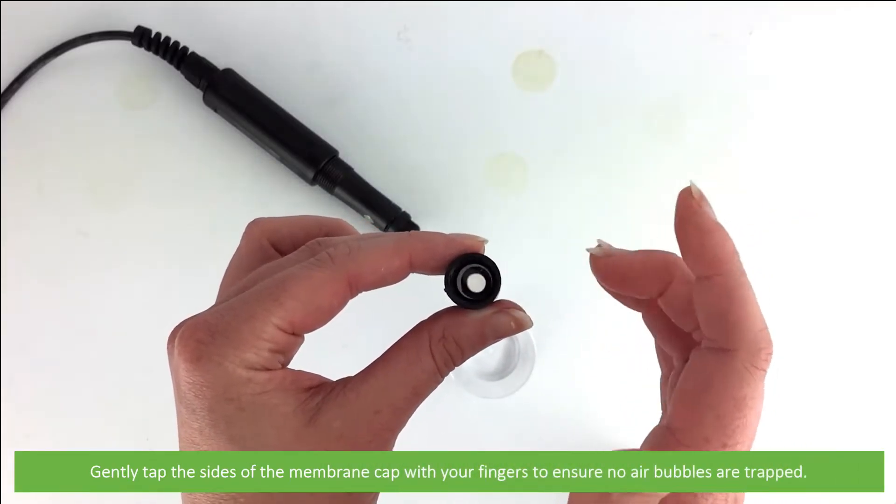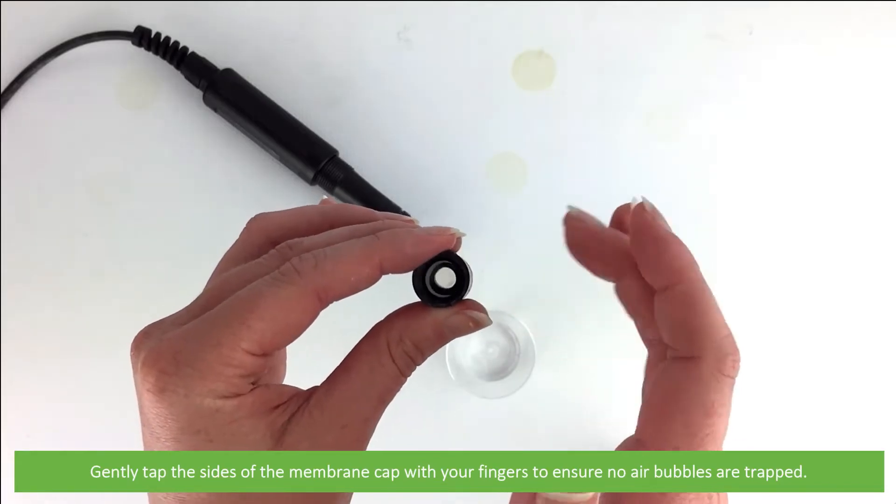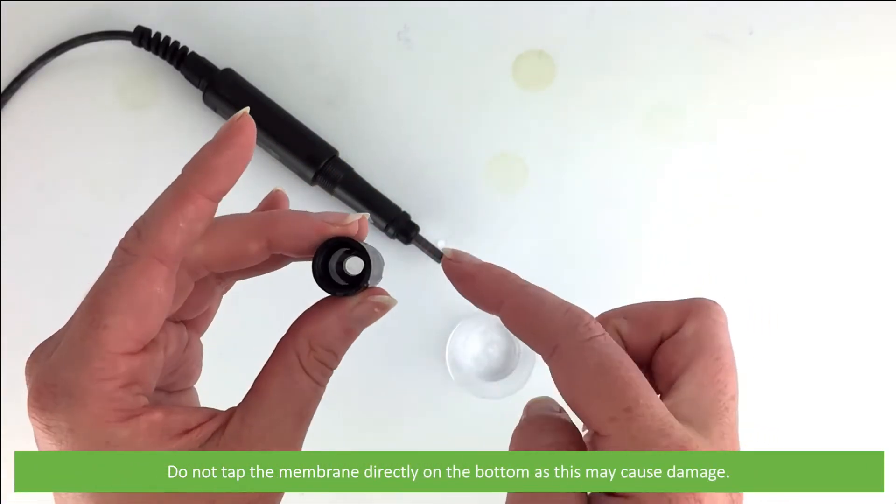Gently tap the sides of the membrane cap with your fingers to ensure no air bubbles are trapped. Do not tap the membrane directly on the bottom as this may cause damage.